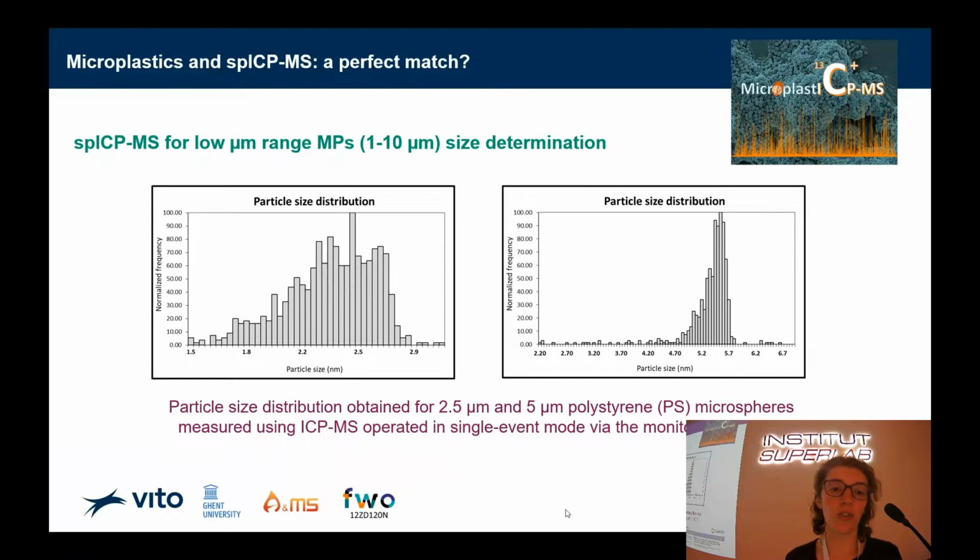Mostly in consumer products where the concentration is quite high, because in order to use single particle ICP-MS, you need a high concentration of microplastics in your sample, although for metallic nanoparticles, it's another story, where you can really go into the nanogram range.